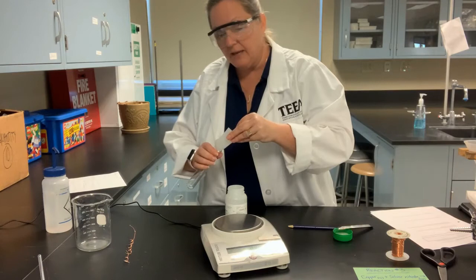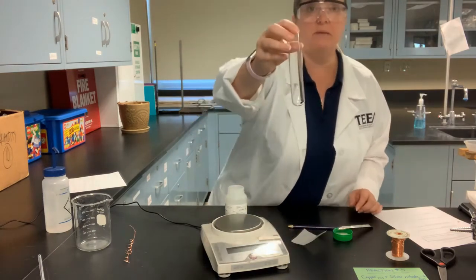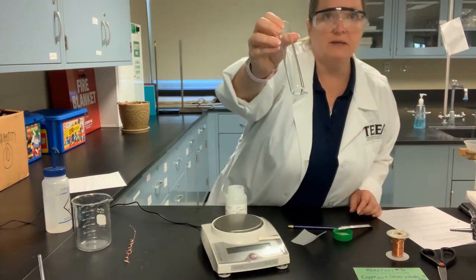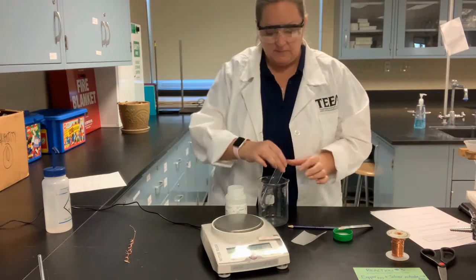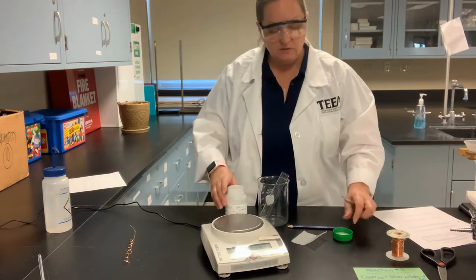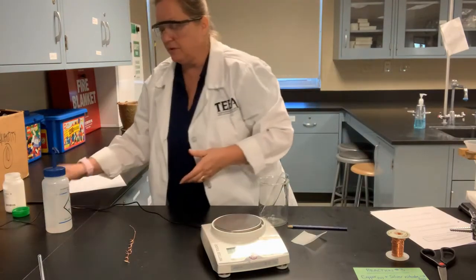And now I'm going to go ahead and just slide that silver nitrate right into my test tube off of the piece of paper. And weighing paper is basically like a wax paper so that the chemical doesn't stick to it. And then I'm going to place this back in my beaker, and the beaker's just here to kind of hold things to keep it from spilling. I'm going to set the silver nitrate over here out of the way.